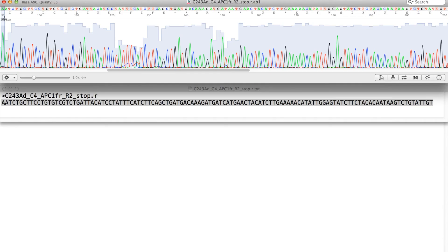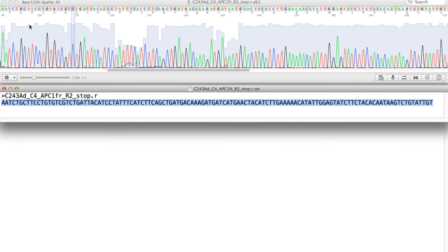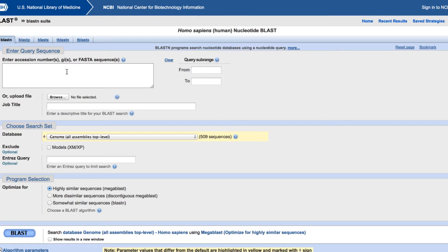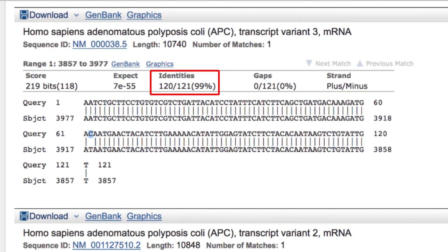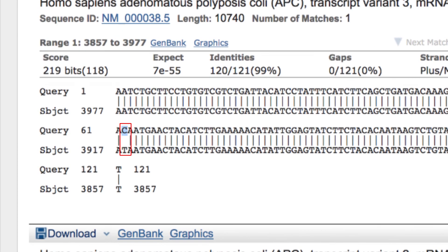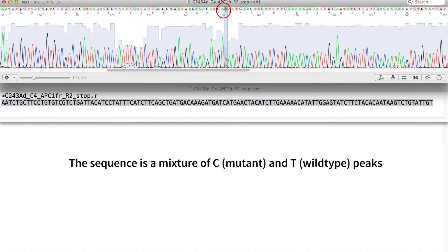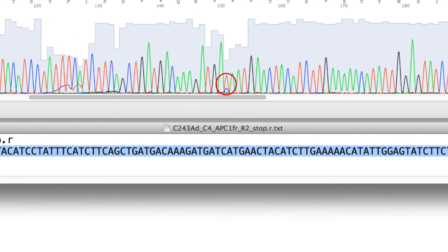Once sequencing has finished, an ABI file is generated containing our sequencing data. This can be opened by software such as 4Peaks and is summarised as a chromatogram or sequencing trace. The bases are read on the x-axis left to right, and we can output this as a text file for further analysis. The y-axis represents the intensity of the fluorescence for each base detected, which can be used for quality checks. To look for mutations we align our sequence to the human genome using BLAST — the Basic Local Alignment Search Tool — which is free on NCBI's website. This identifies the APC gene as expected, and we can identify a single nucleotide mutation from a mismatch against the reference sequence. Looking back at the chromatogram confirms that this cancer had gained a mutation in the APC gene, which may have been important to the development of the disease.